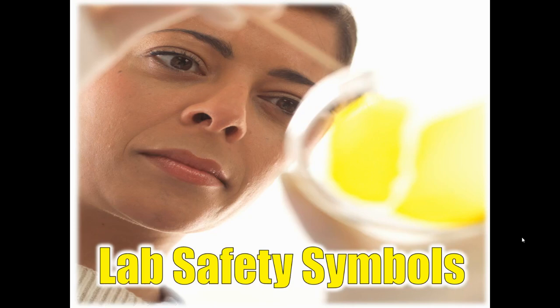Welcome to today's forensics lesson. Today's topic is lab safety. Specifically, we're going to be focused on the lab safety symbols that we might see on a lab sheet this year in forensics, and we're going to be discussing the rules and procedures that accompany these symbols.